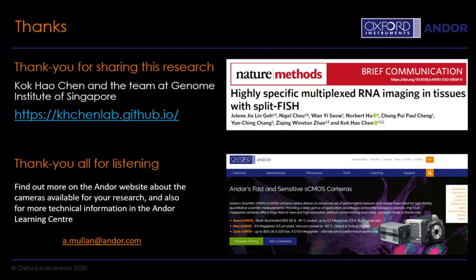Wonderful, thank you. Our next question: I was wondering if you are planning to commercialize the split FISH technology or reagents. Well, we don't have a way to sell these reagents, but if you email us, we can help you design the probes and tell you where to buy them from.